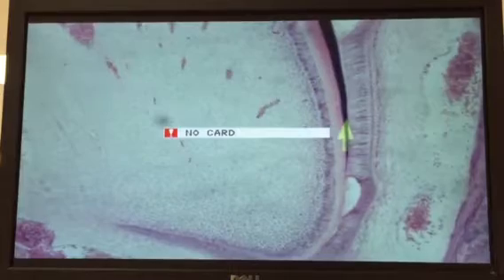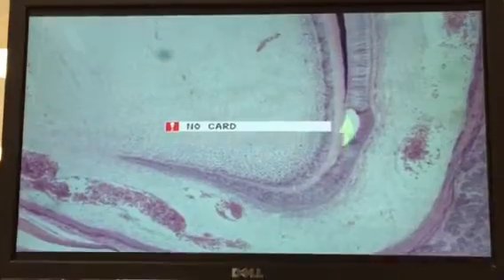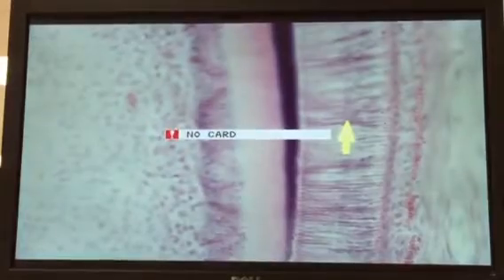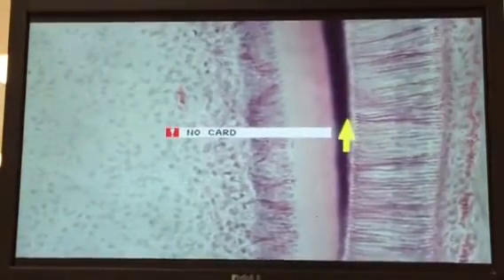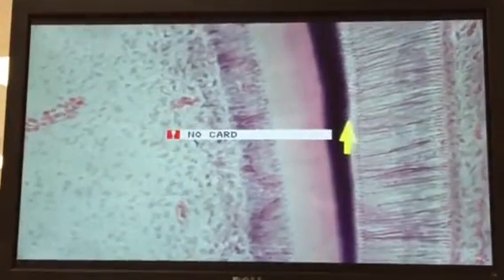So as we orient ourselves, we need to find where that enamel is being laid down, and you're going to have a very short length in which you'd have morphogenic and organizing that will come right into synthetic or formative right here. And so there are the ameloblasts, staining not quite so good on this one. But you can see those little pits that once were occupied by Tomes processes. Well, that we've seen in those other slides.